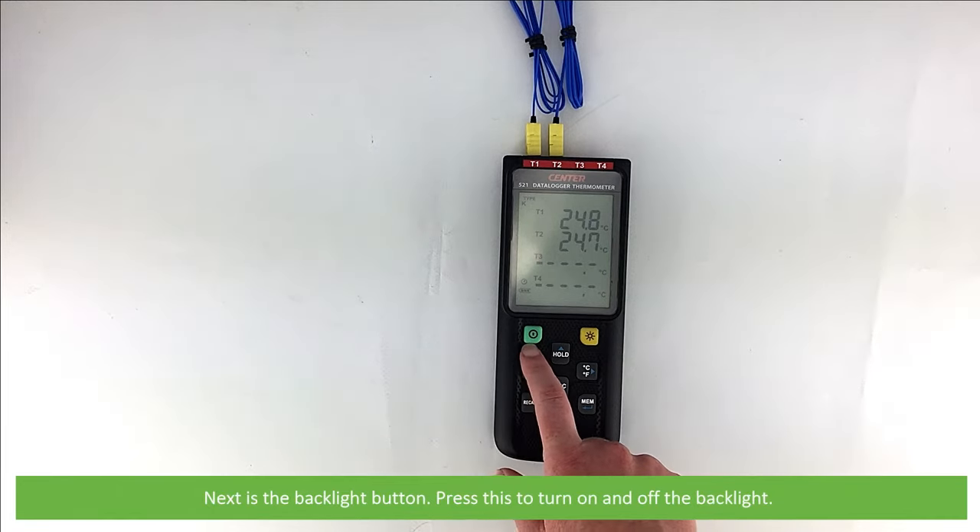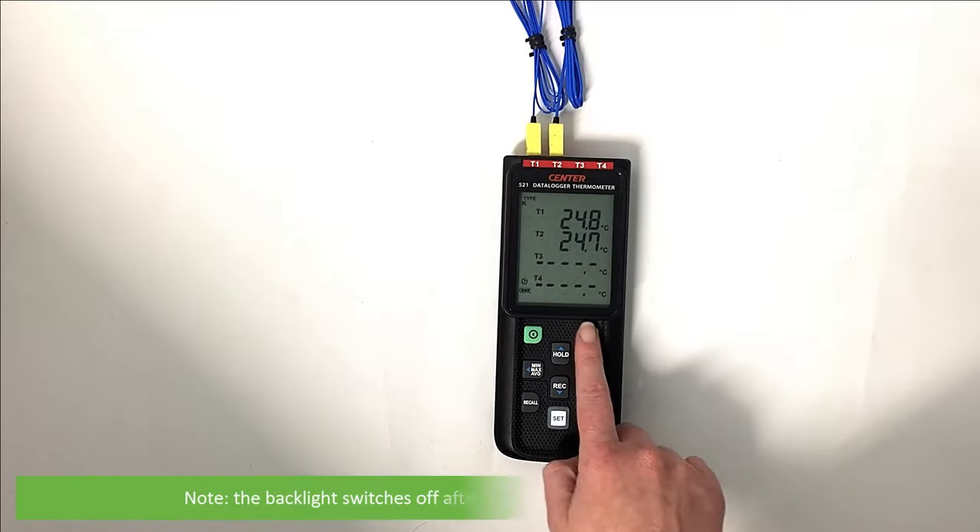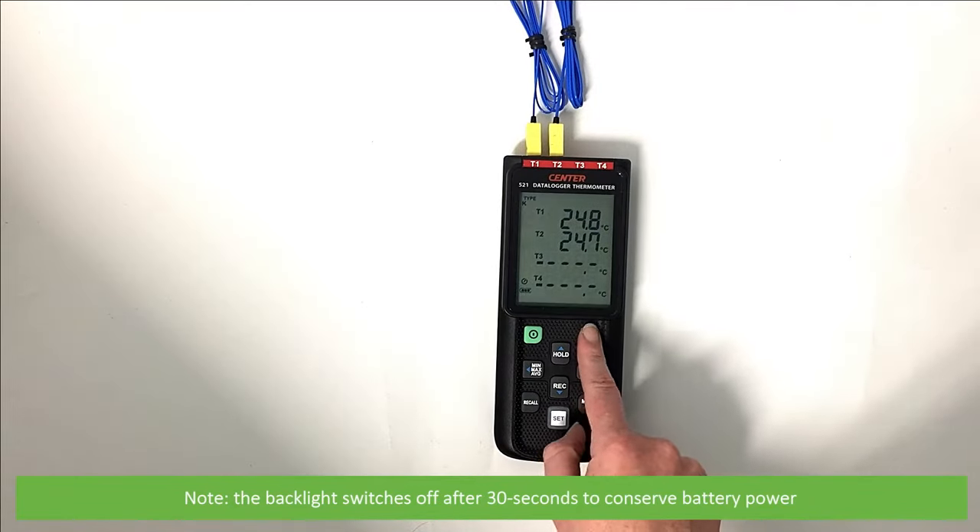Next is the backlight button. Press this to turn the backlight on and off. Note, the backlight switches off after 30 seconds to conserve battery power.